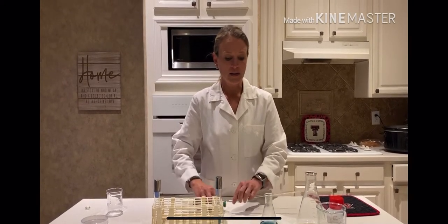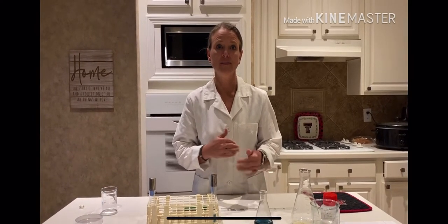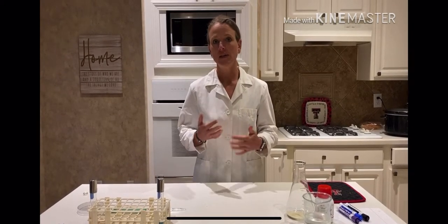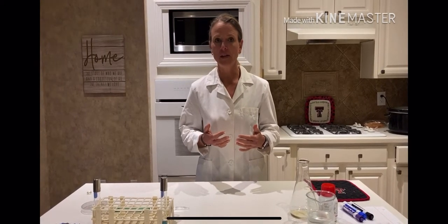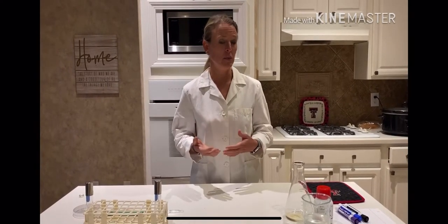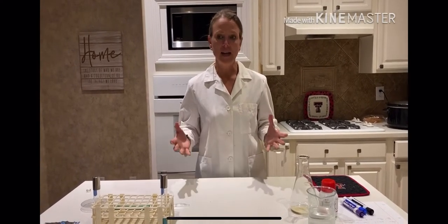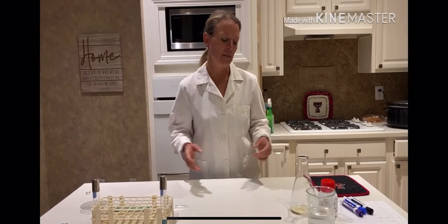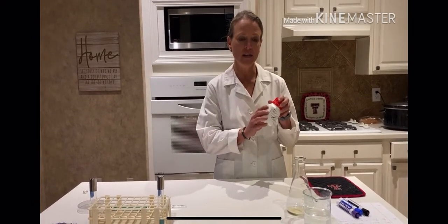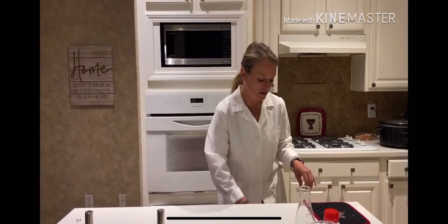Now we're going to take a short break and then I'm going to show you how to make the nutrient agar. Welcome back. Now I'm going to show you how to do the nutrient agar preparation. It is virtually the same as nutrient broth preparation, except remember that with nutrient agar it's going to solidify at room temperature. So it's very important that we boil this to make sure the agar goes into solution and is nice and homogenous, thoroughly mixed up. We do have a calculation as well that you find on the bottle telling you how much powder to weigh out and how much water to add.